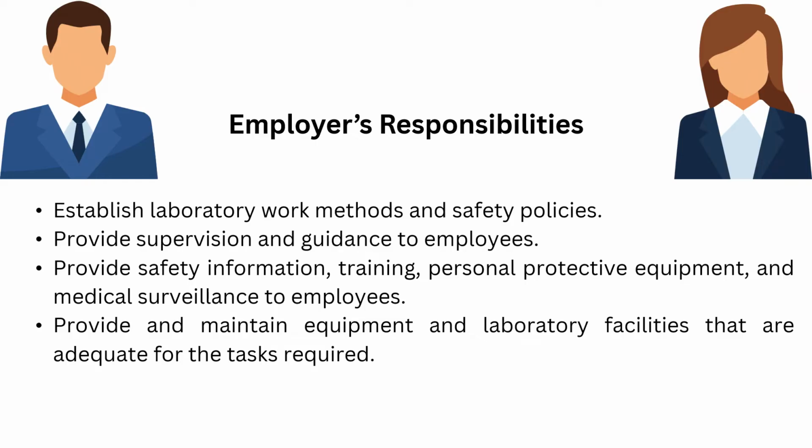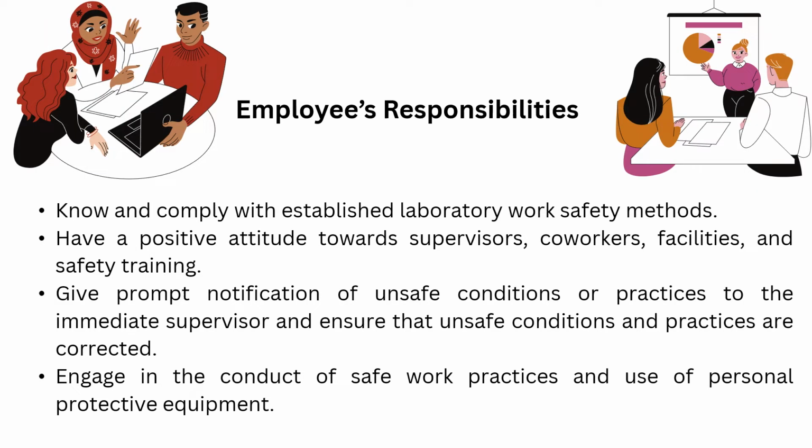Again, while the individual employee has an obligation to follow safe work practices and be attentive at all times to potential hazards, our employer has the ultimate responsibility for safety and delegates authority for safe operations to laboratory managers and supervisors. The employee, on the other hand, also has a responsibility for his or her own safety and the safety of their coworkers. Employee conduct in the laboratory is a vital factor in the achievement of a workplace without accidents or injuries. So, below here, class, are the employee's responsibilities.